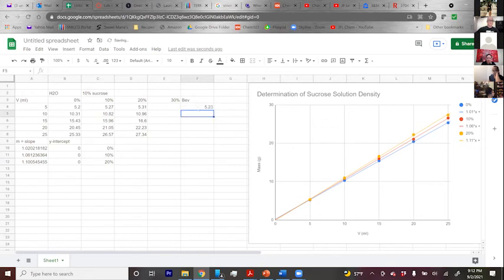5.23, 10.67, 15.99. Then it'll just show up on the same plot, and then you just click on beverage over here, or click on any one of these spots, select beverage, and then get the straight line fit for that as well.